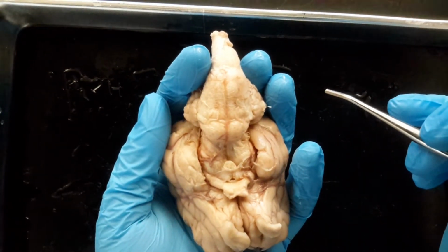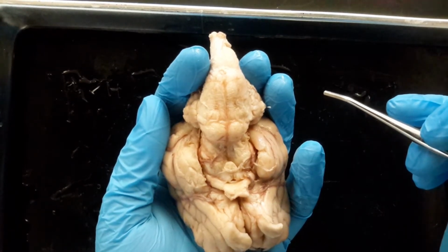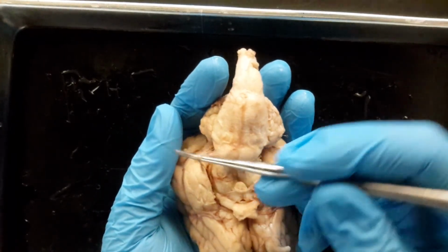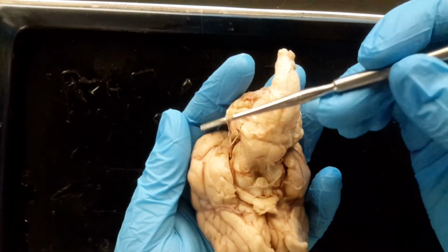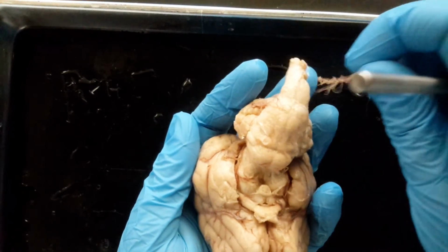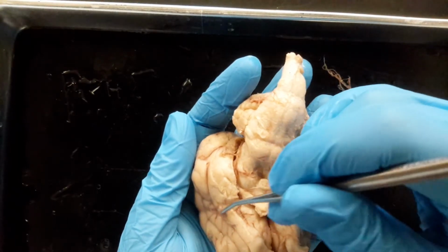Let's see here. Other structures. We're going to need to do a little bit of cleaning, so I'm going to show you a little bit right now. I just stuck the probe underneath some blood vessels and just gently pulled, and they'll come off really easy. So I'm using a blunt probe first.